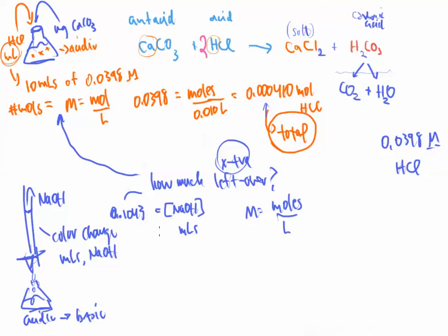And let's say the number of milliliters that it took in order to titrate was 2.21 mL. So, I added the acid, neutralized all of the base, and had extra acid left over. I took that flask and titrated it to figure out how much was actually left over, and that took 2.21 mL.